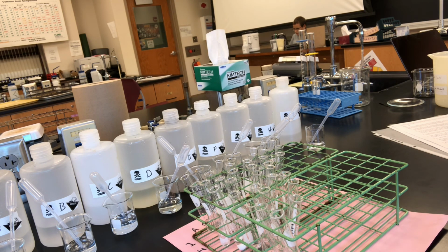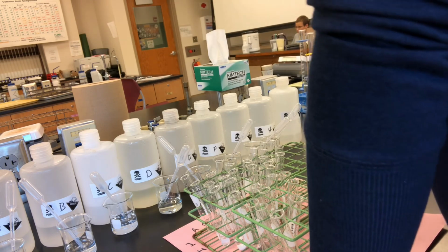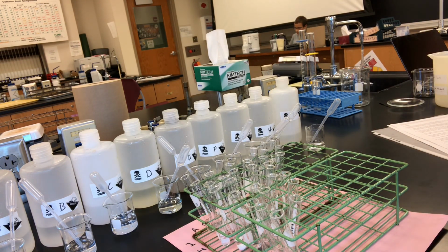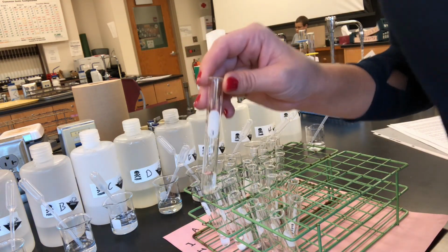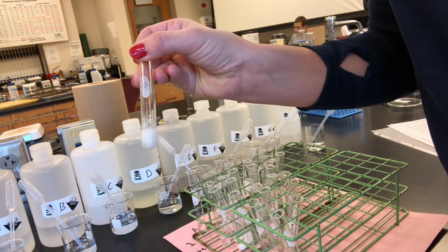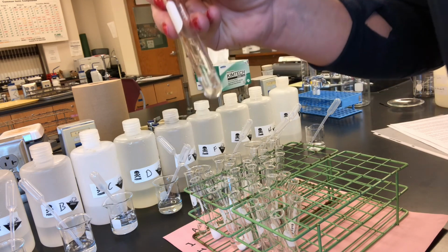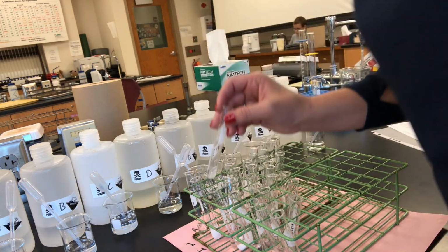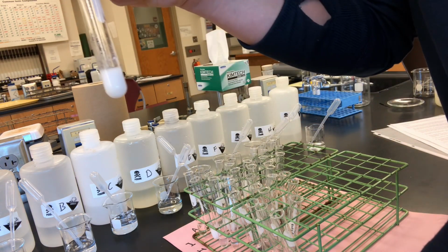You can run back through it. Let's do that real quick, just to recap, because it's only a 20-minute lab video. Let me go ahead and mark it. A, just double check we got it all right. A and I, no change. A and H, white precipitate. A and G, looks like no change. A and F, definitely had some action there.